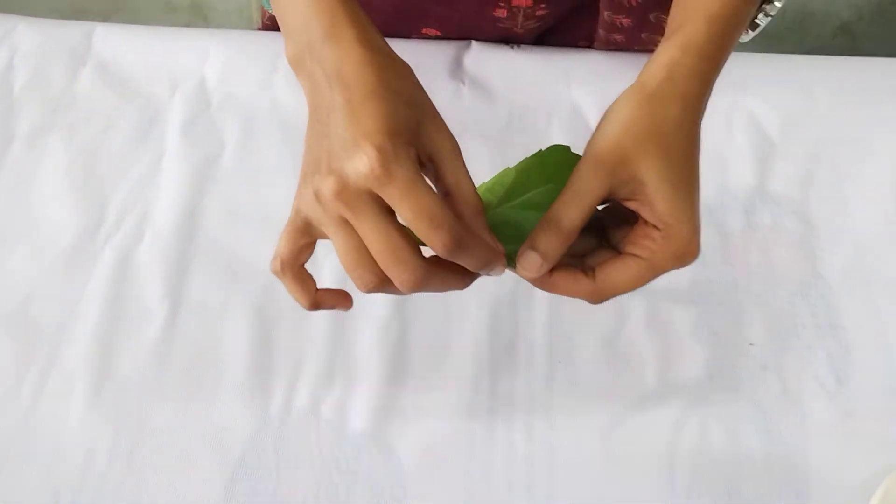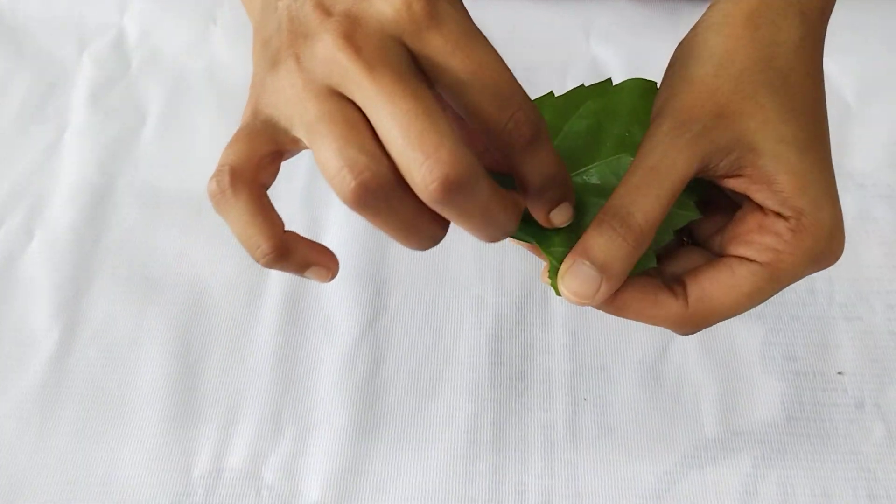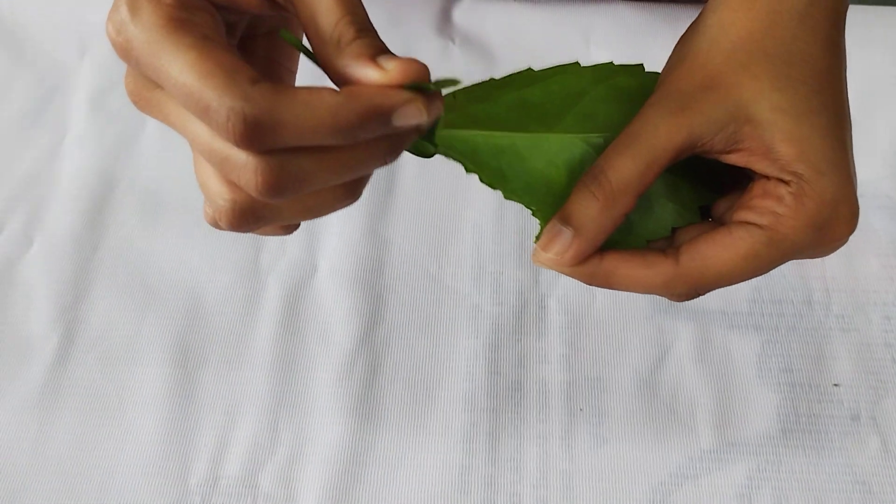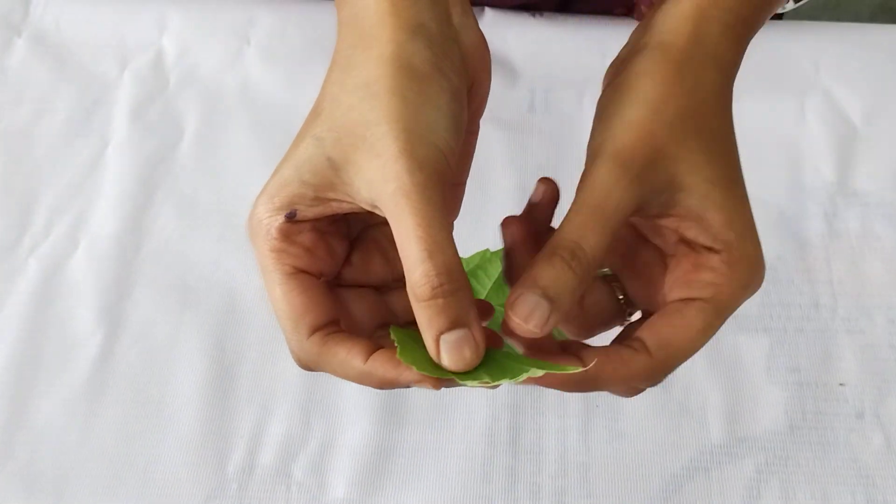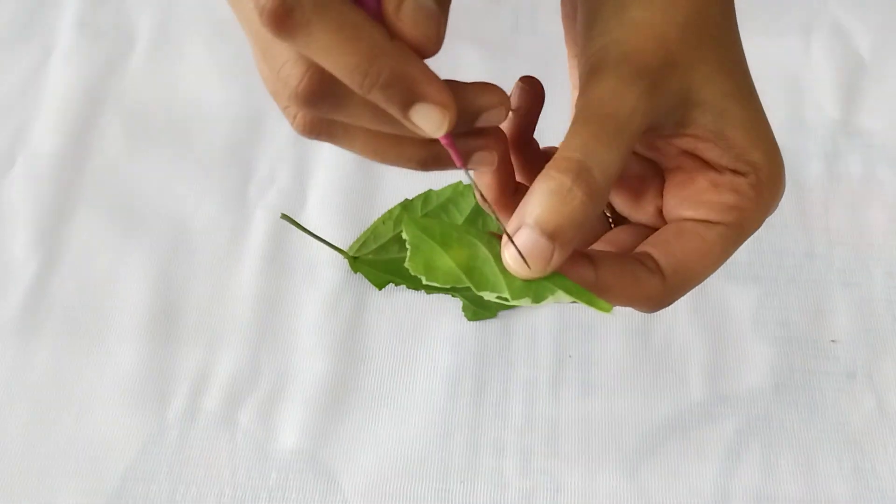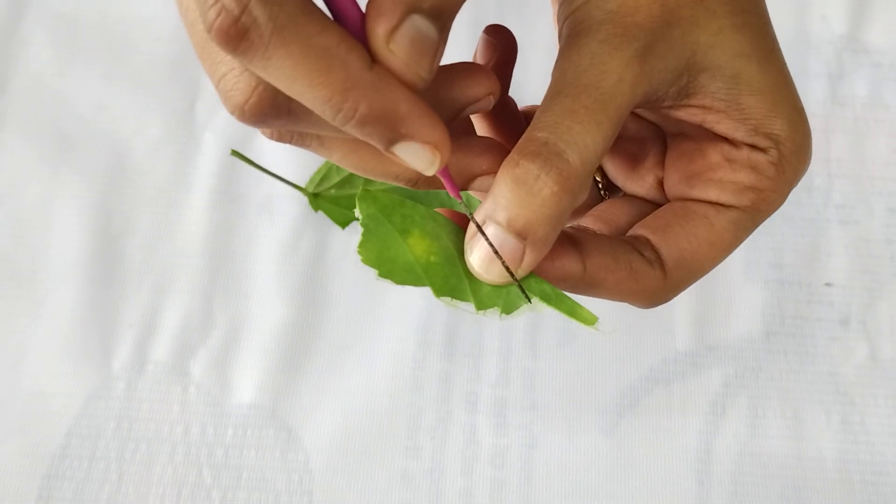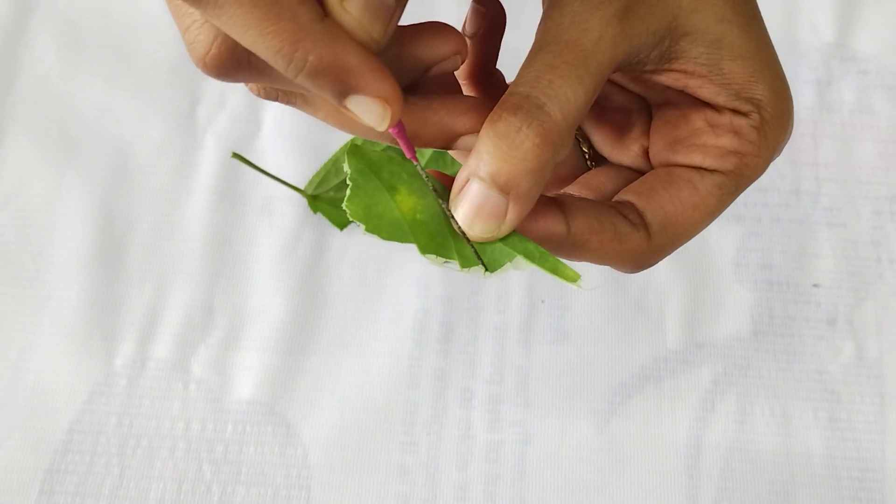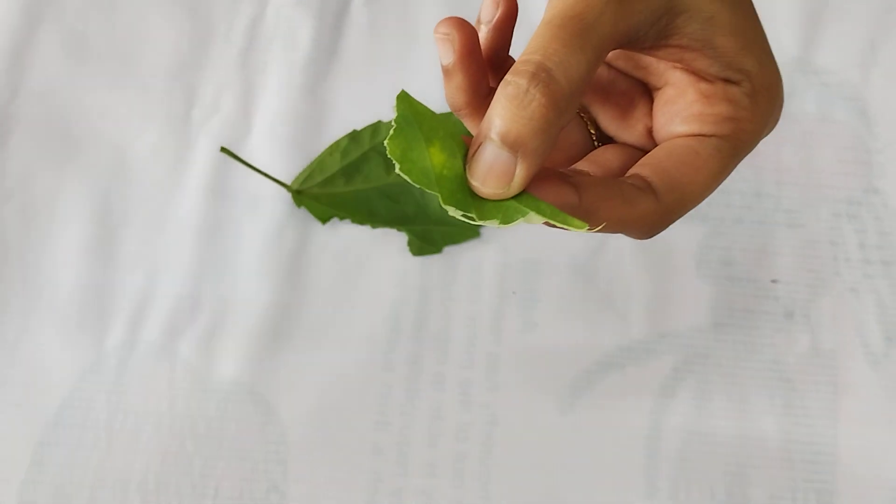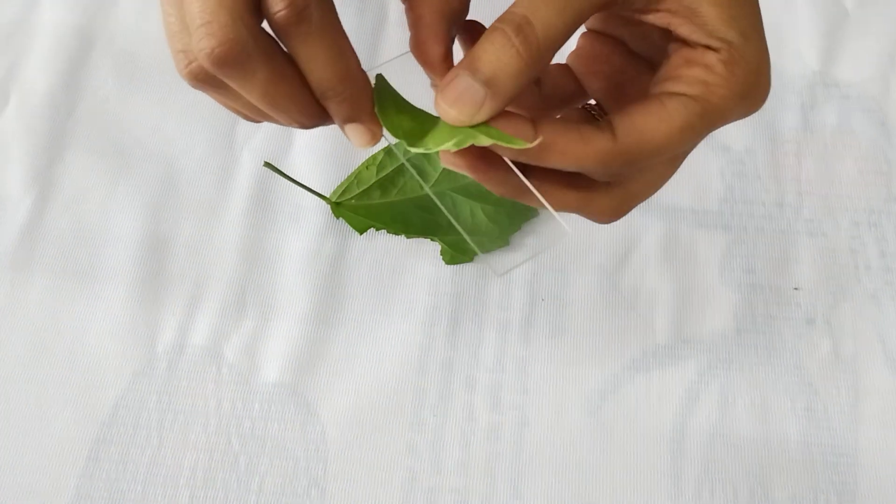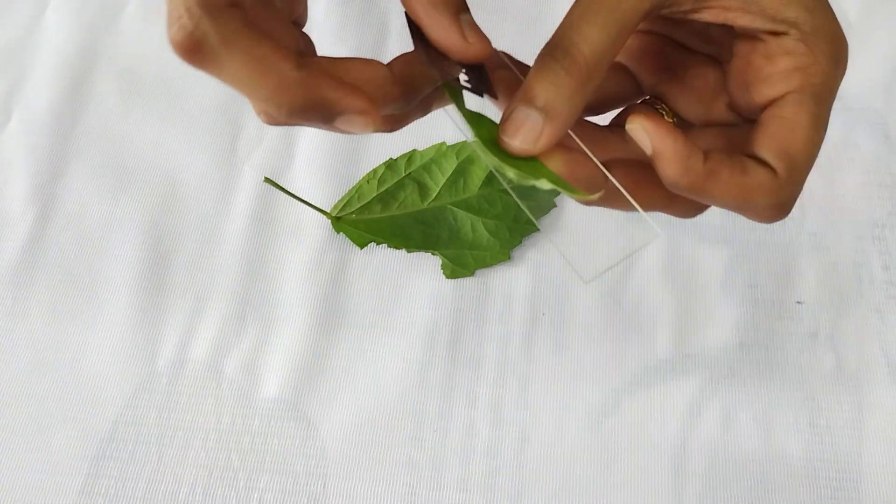First of all, we have to tear the leaf like this. Then we have to use this semi-transparent or white part, that is epidermis of this leaf, for this slide. Now we are going to cut this part.